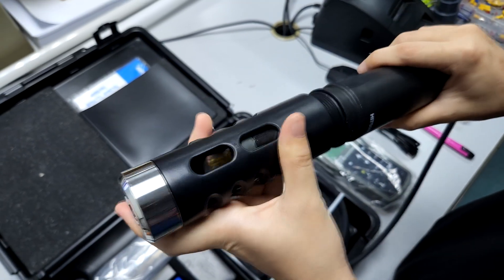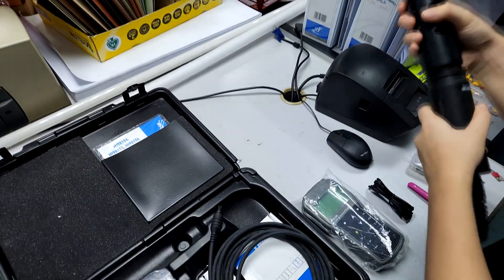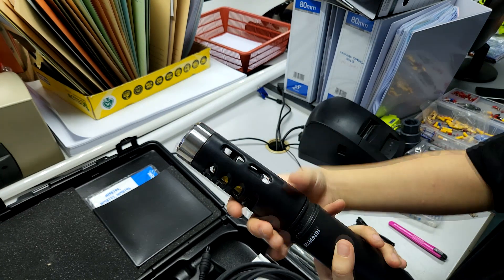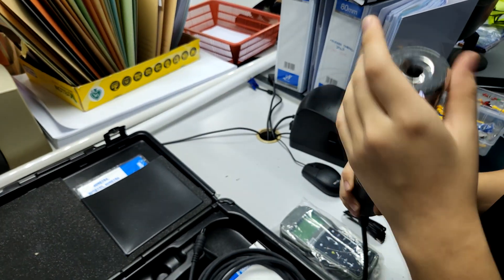At this stage, because this probe is slightly different, it does not directly connect into the probe body. We can actually replace this probe if it's damaged, unlike the previous unit which was soldered and connected internally. We can change it out if necessary.